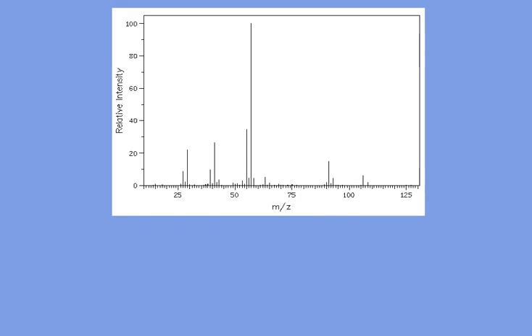If we look at the mass spectroscopy, there is something a little bit more interesting than just a molecular ion peak, although it does concern the molecular ion peak. We can see those two peaks close together, separated by 2 units of mass, and from the size of the peak it looks like a 3:1 ratio. Is it just a fluke? Well, if we look just a little bit further down the mass spectroscopy, we see that 3:1 ratio again. So it doesn't seem like a fluke. It looks like there's something there on the molecule which lasts for a while before being knocked off.